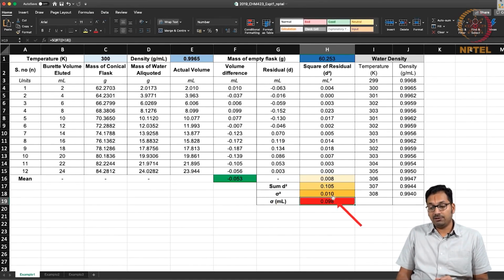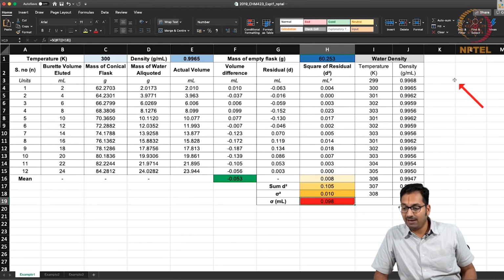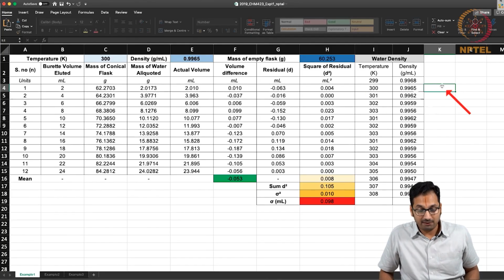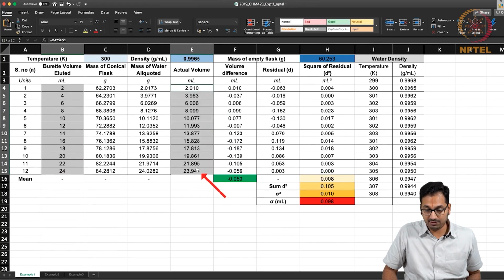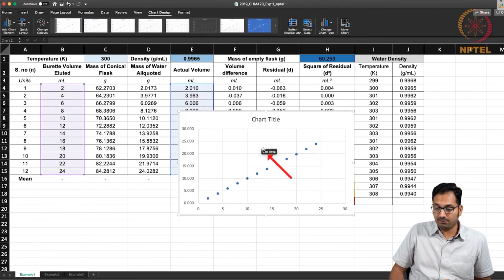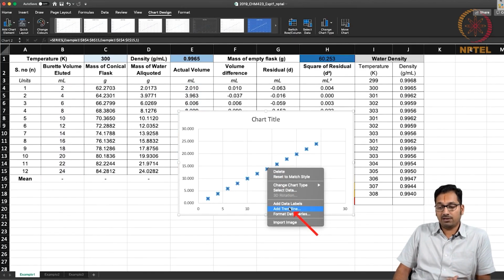Okay, so now that we have understood this is a representation of the precision of measurement, what is my average? We should be able to understand the average by defining yet another cell here. The average can, on the other hand, also be obtained by a quick fit. I hope you have learnt what a fit is in the previous classes. So let us try to do a fit of the variable that you changed, the independent variable, to the dependent variable that you got from the measurement. If you do a scatter plot, you will nicely get a linear curve, and this should help us understand the accuracy.